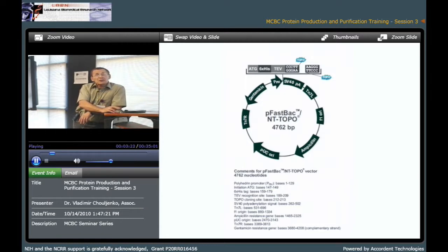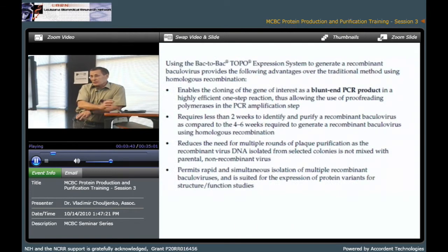Next, the amino-terminal version is very similar. Basically, everything is moved to the 5' end of the construct. In this case, you are not supposed to include your ATG initiation codon in your sequence, and the termination codon has to be present in your gene of interest during primer construction.